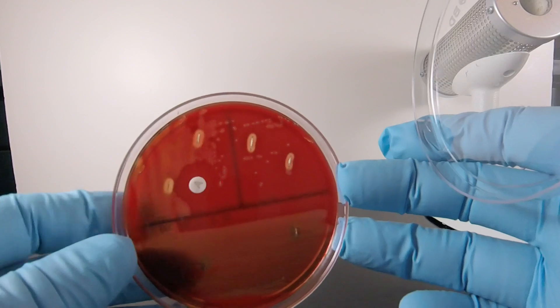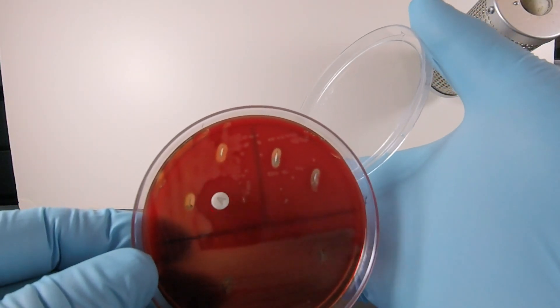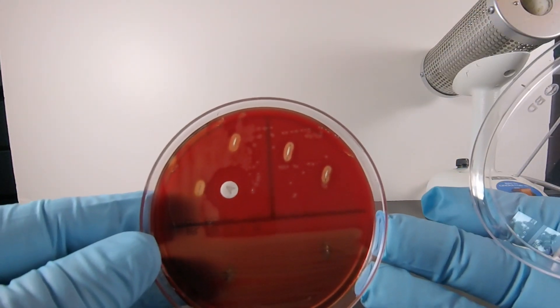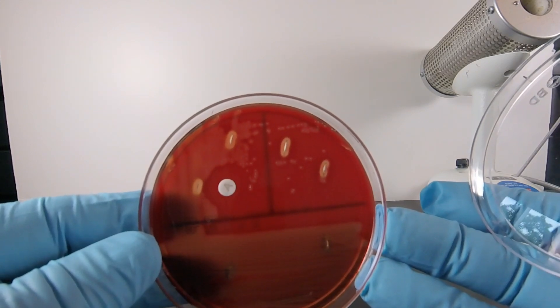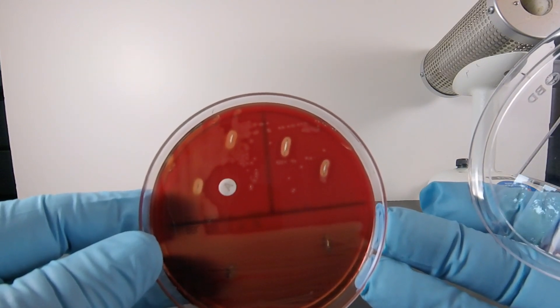You also see a nice zone of inhibition around the Taxo A disk, where there's no bacteria growing because it's sensitive to the bacitracin in the A disk.